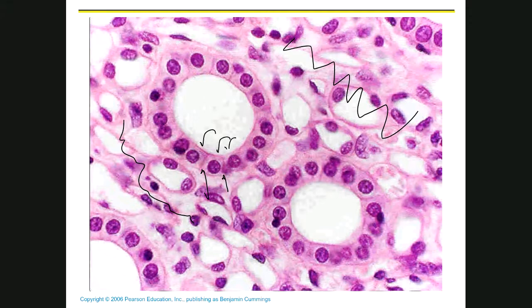And look, what we have is a tube or a tubule. And these cells, there's the cell right there, cube-shaped, big round nucleus. You can see that here, over here, and over here. And look how perfect these are. That's a cube.